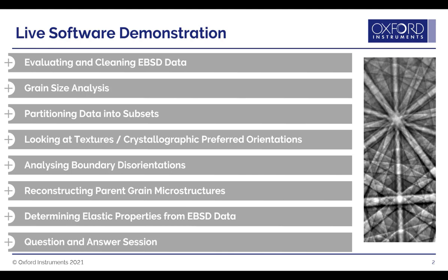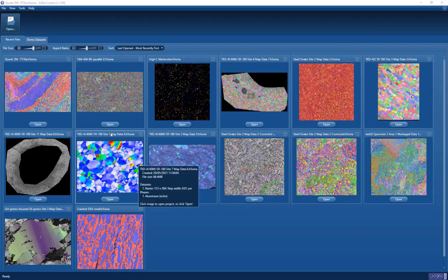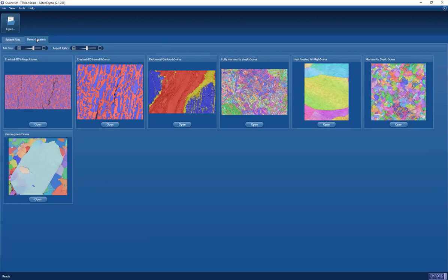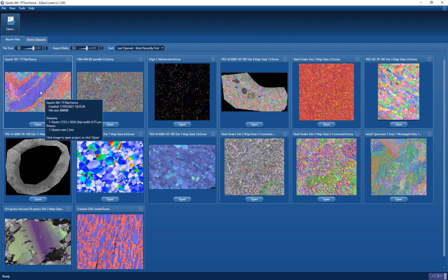There should be a little bit of time at the end, maybe four or five minutes for questions and answers. So with that let's crack on to the demonstration. We start off here with the opening screen of our software Aztec Crystal, where we can graphically visualize recently opened data and we have a second tab that shows demonstration data extensively used in our help files. I'm going to start by opening a geological data set.